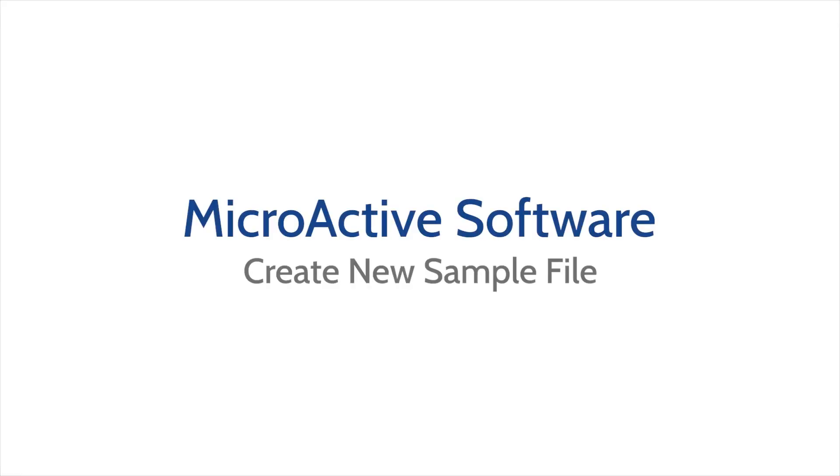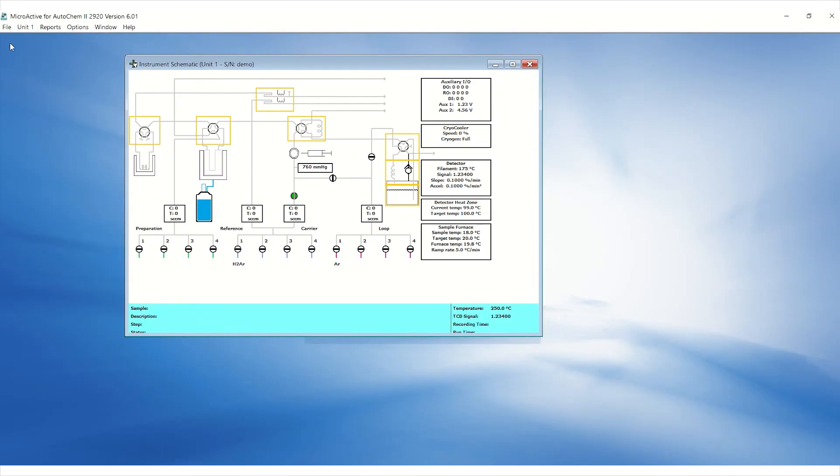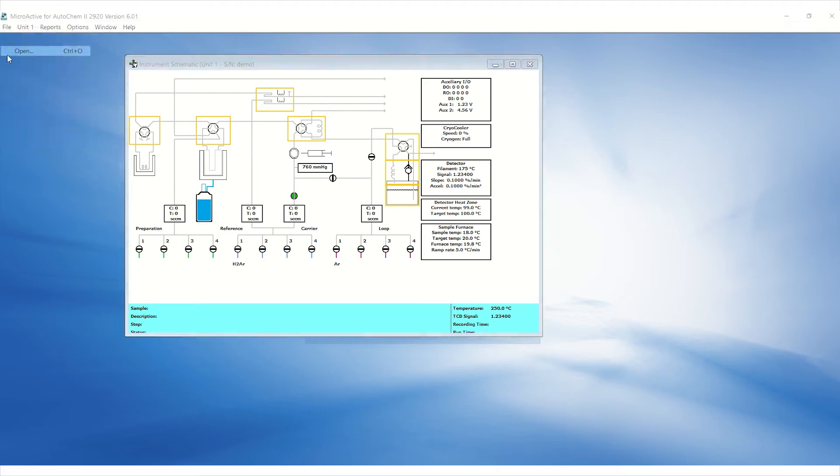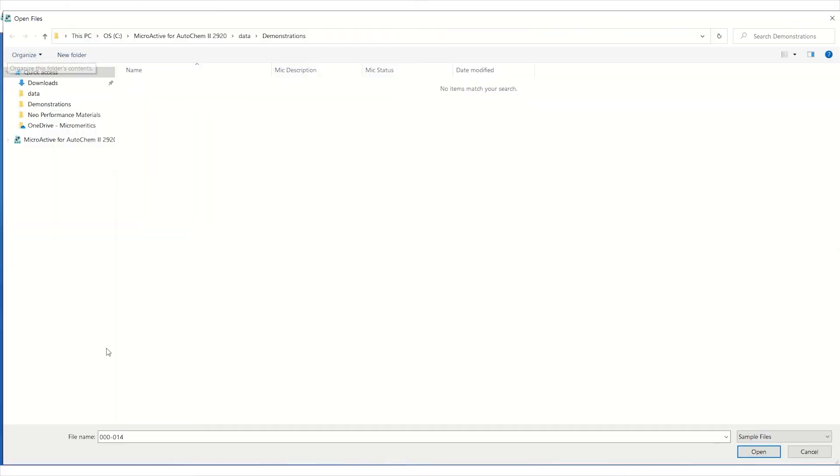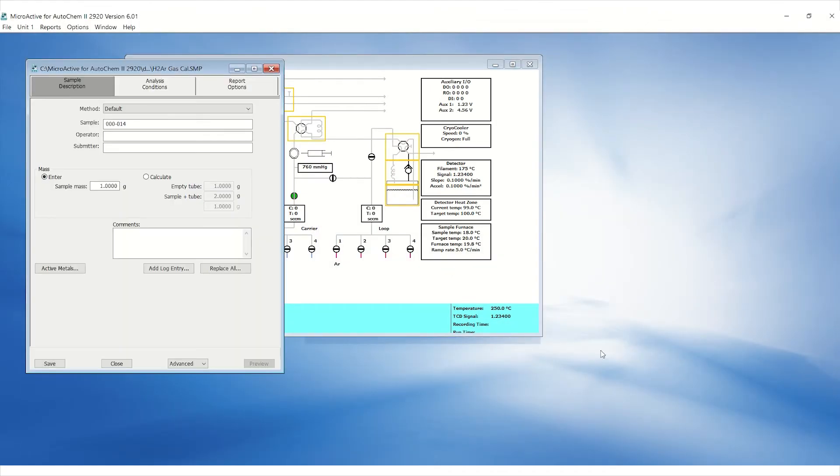In the MicroActive software, make a new sample file. Click on file, open, and then enter the name of your choice. Click open and select OK when asked if you wish to create the file. This will create a new SMP file. Enter your sample name and operator's initials for future reference.